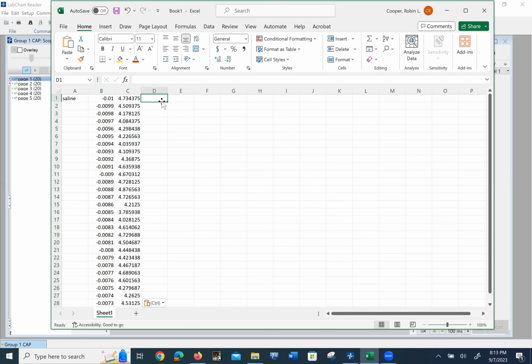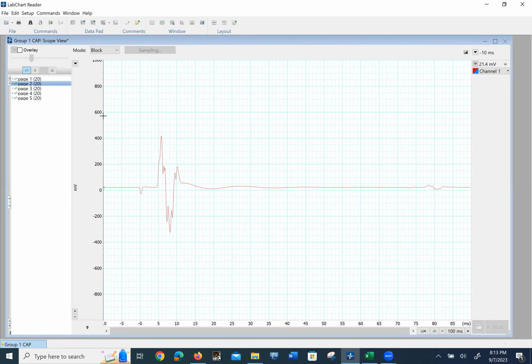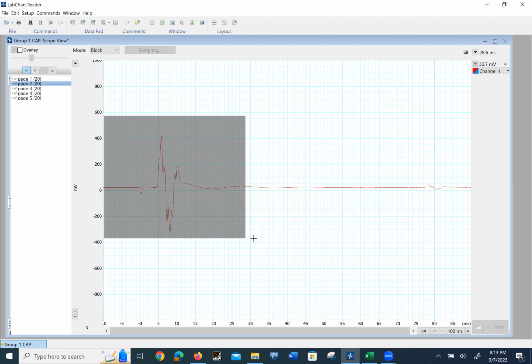Now I want to do, in this case, lithium at 0. So I'm going to put L0. I'm going to put this over here. Now you see the time that it started recording. It's 10 milliseconds before the 0 line, where 0 is. But the next time, I hope to be able to get it at the same spot. I will on purpose not do it exactly against the window so you can see what we can do.